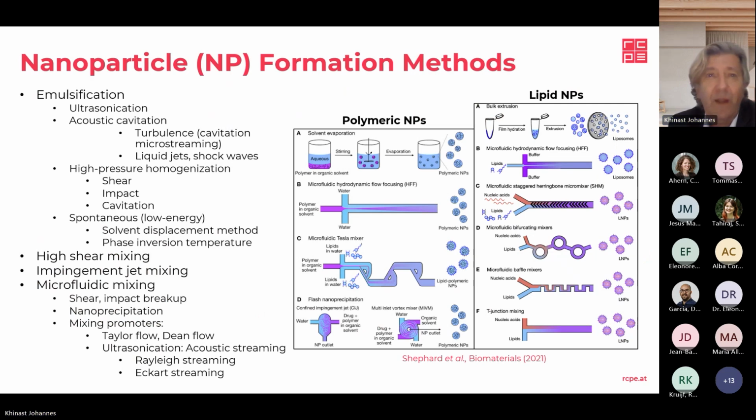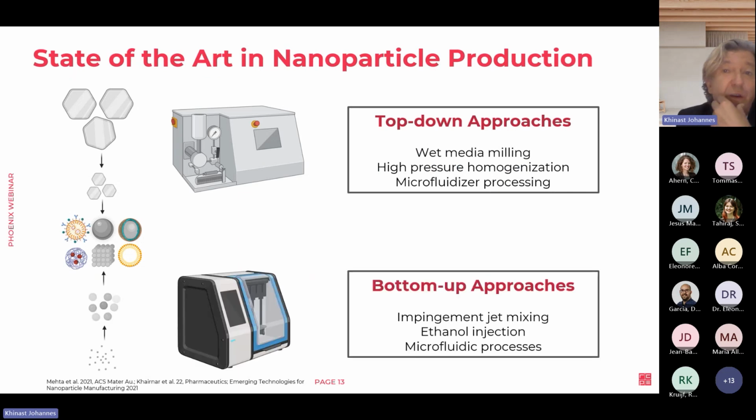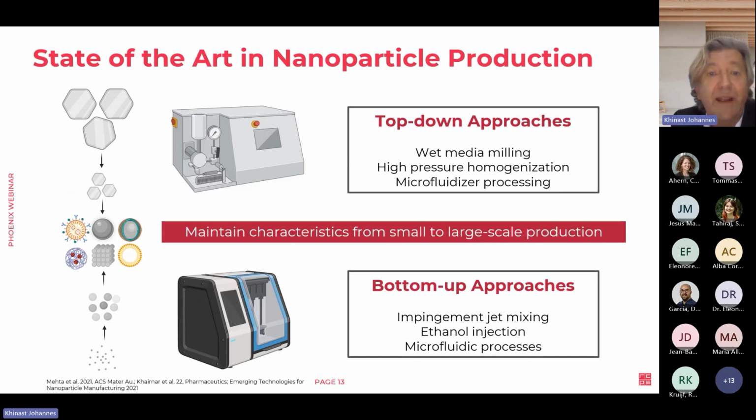And we all know that there's a huge variety of different particle production processes for nanostructures. Not all of them lend themselves easily to continuous manufacturing. I have to admit this, but many of those, without going into much detail about which ones are better and which ones are worse, can actually be implemented in continuous manufacturing. Some of those we've been doing are top-down approaches, for example, high-pressure homogenization, where you break down large particles to make smaller ones, or bottom-up approaches like impinging jet mixing, where you have two phases which are immiscible, but if you mix them in the correct way, then you can produce nanostructured systems. So both top-down and bottom-up approaches can be used to make nanostructured systems.